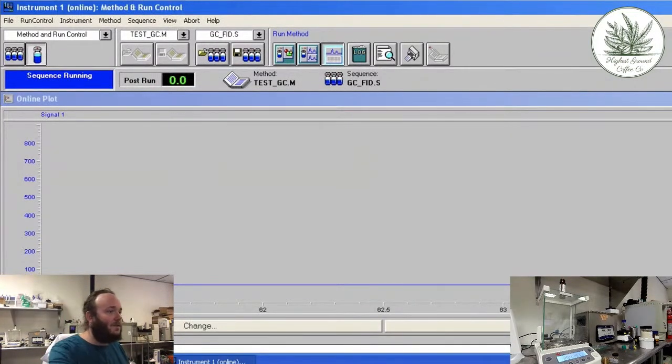Unfortunately, the auto sampler tower that's behind me over here is slightly leaning because of the harness that's set up for it. And for whatever reason, occasionally it misses. So I gotta reset it, or reseat it rather. Hey Phil, all right, cool. So yeah, I see you in here now.